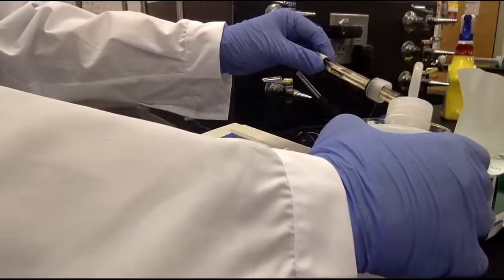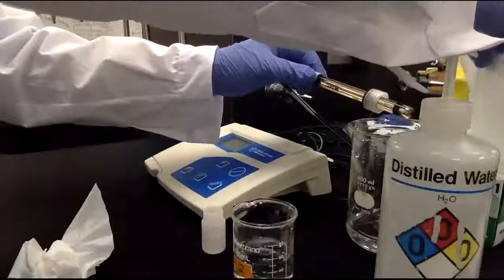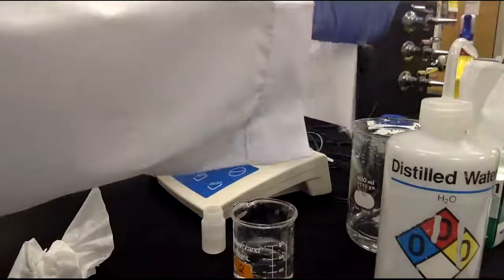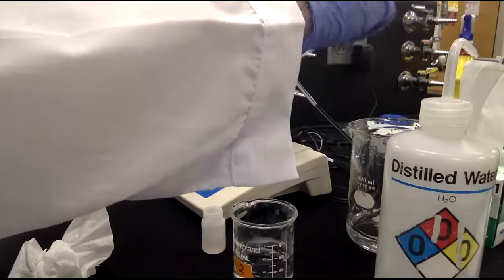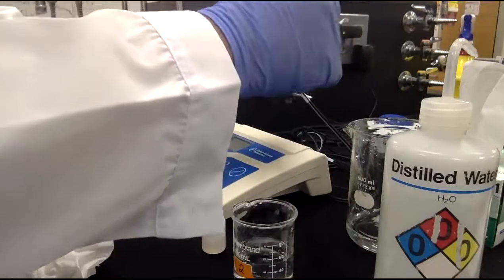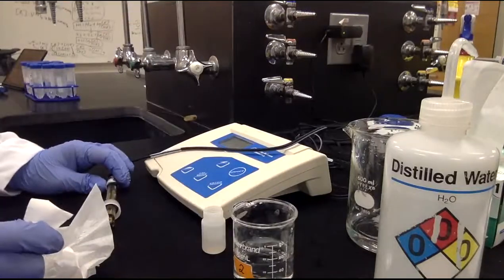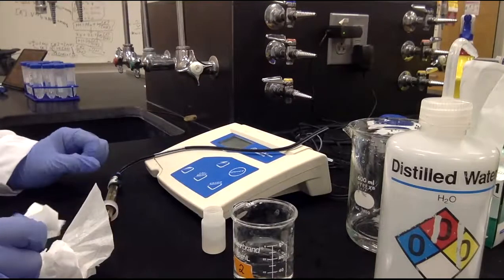So the second part is you just pick up 2 of the buffers you just made, and for one of them, you add 500 microliters of the strong acid. Then you stir it, measure the pH. For another one, you add 500 microliters of the strong base. Stir it, measure the pH, and that will be it.